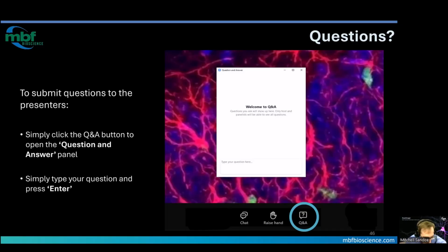I mean, it's kind of hypothetical, but I'm thinking you would sort tiles by power and then sort tiles by distance from each other, and try and make the best of whether you think it'll take more time to transit from this tile to this other tile over here with the same power, or take more time to rotate that half-wave plate.